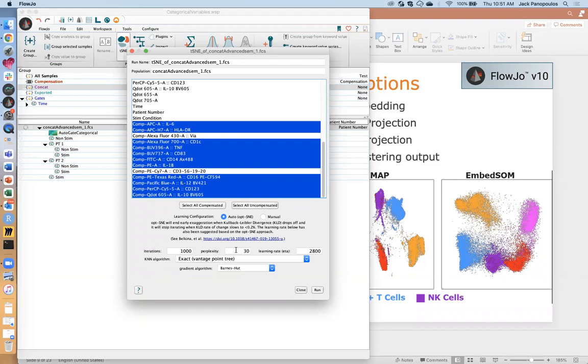I find that it has the highest influence on the white space between islands. So, if you find that your tSNE isn't well separated, you can always come in here and play around with this number. I think 30 is a good starting spot, but it doesn't work for every data set. So just know that you may have to come in here. And my understanding of the learning rate is this is a knob that will either speed up or slow down the algorithm, but to some extent opt-SNE either usurps this or at least helps, so that this value is not so important in the outcome of the projection.